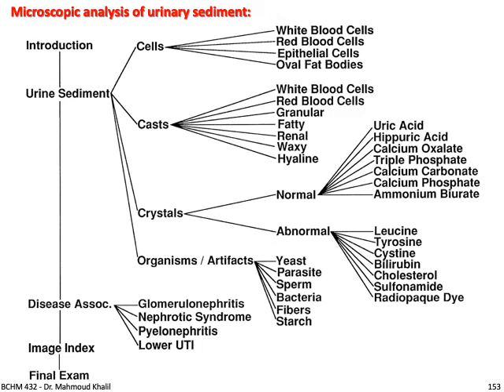This slide is very important to dissect all the microscopic analysis of the urine. You take the sediment, you check for cells, casts, crystals, organisms. You relate this to an associated disease, either glomerulonephritis, nephrotic syndrome, pyelonephritis, or lower UTI. You give an image index, and you have a final exam. So this is a very good slide to summarize all the microscopic analysis.